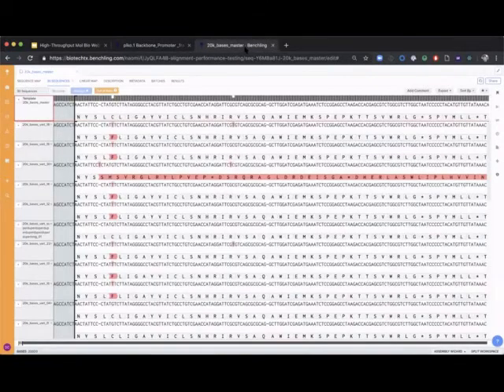And so you can imagine doing something for a much larger alignment, something that might look like this, where you're aligning 30, 40, 50, 60 sequences in one alignment. This allows you a more global view of the samples that you prepped on the bench compared to the ones that you've designed in Benchling.